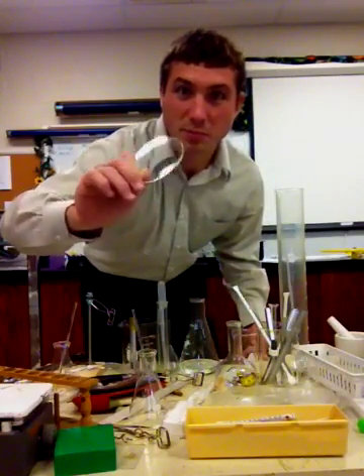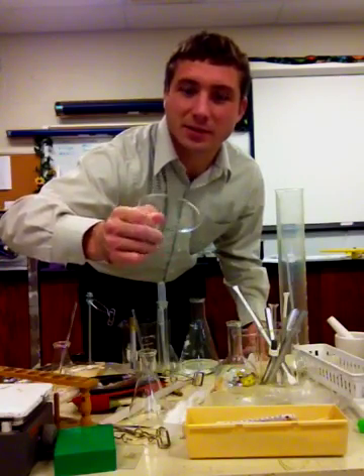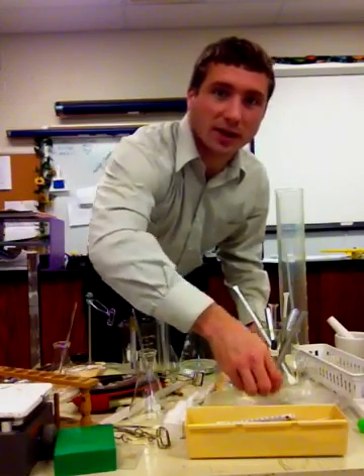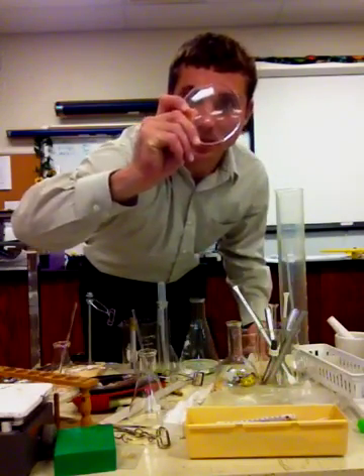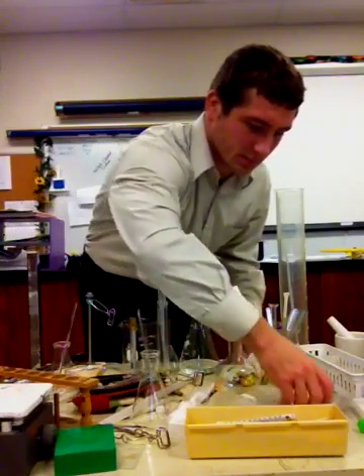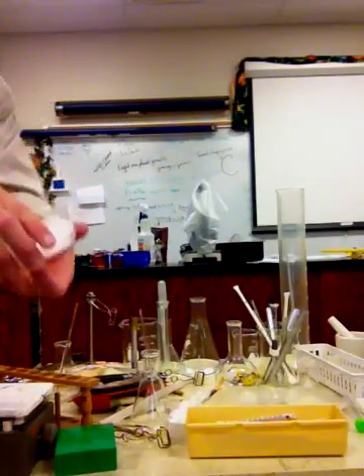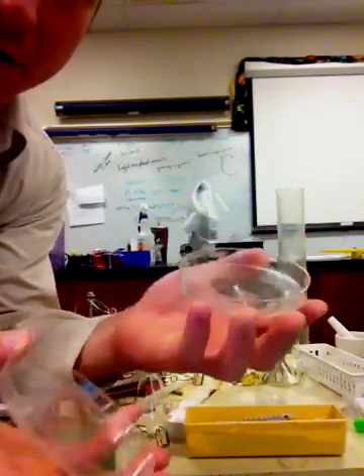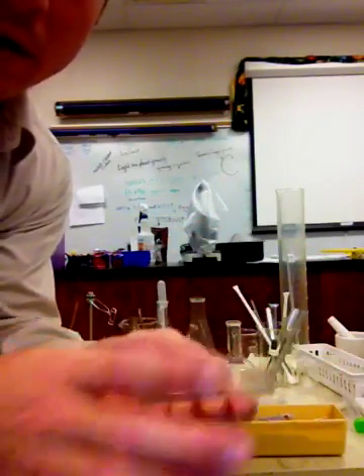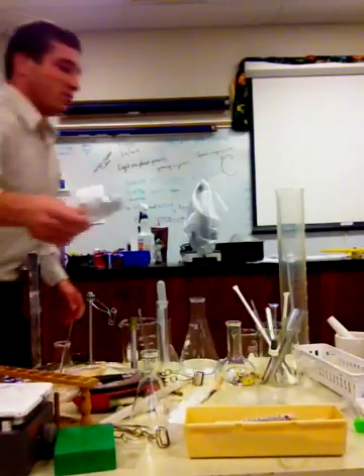Right here, this giant thing that looks kind of like a contact is actually known as a watch glass. This object here is a petri dish. If we're ever growing something, or we want to keep the outside outside, we can put a substance inside the petri dish.